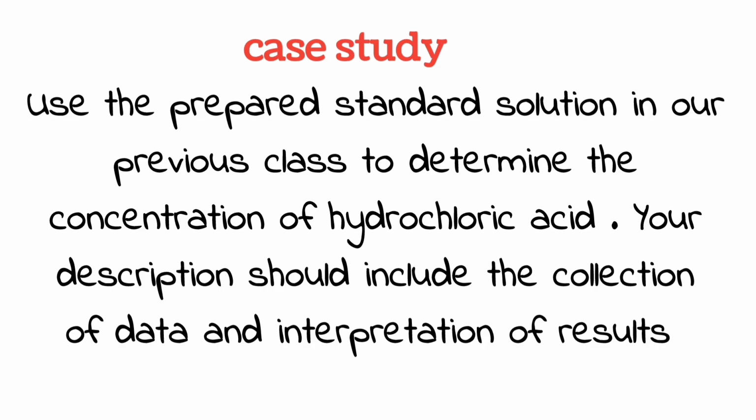Your description should include the collection of data and interpretation of results. In our last class, we prepared a 0.1 molar standard solution of sodium carbonate. We are going to use this standard solution we prepared to titrate hydrochloric acid and determine its concentration.